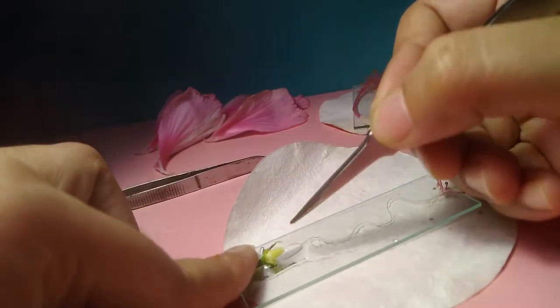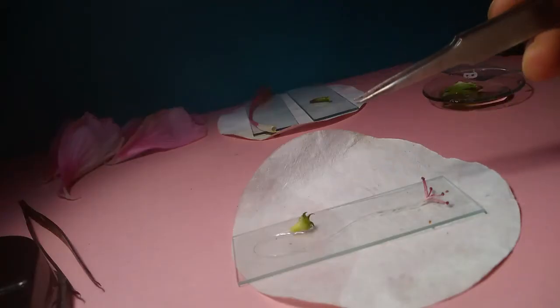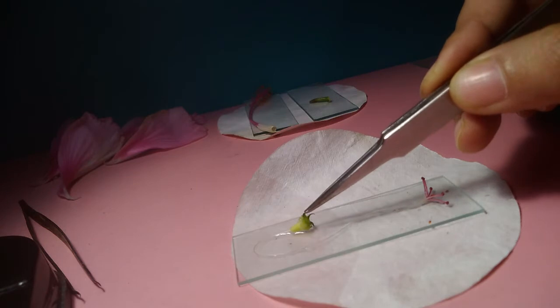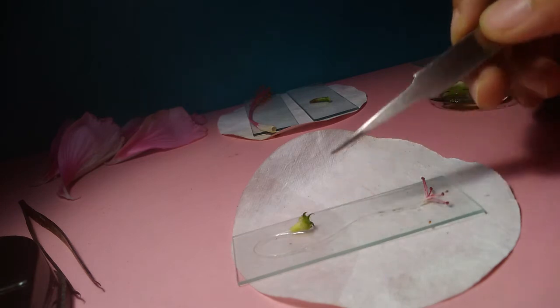So this part, this swollen part is the ovary, and I am going to remove the epicalyx and the other parts. But before that, I want to mention a very interesting thing here, that we can see that the epicalyx are arising from below the ovary, isn't it? This is our ovary and the epicalyx was below it. Or let me put it in a different way.